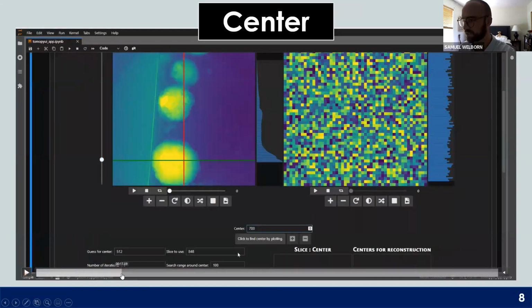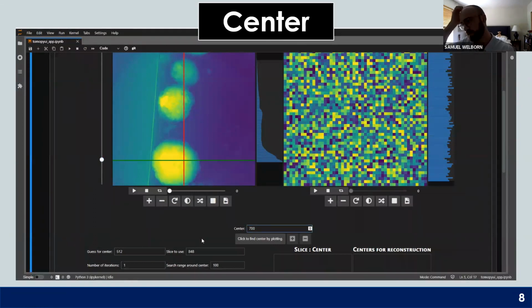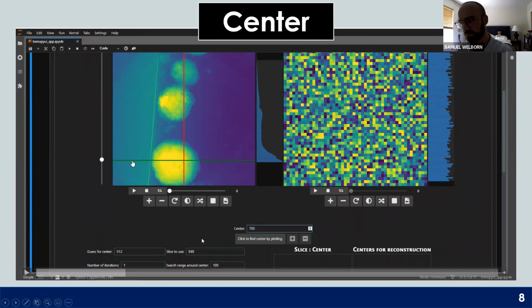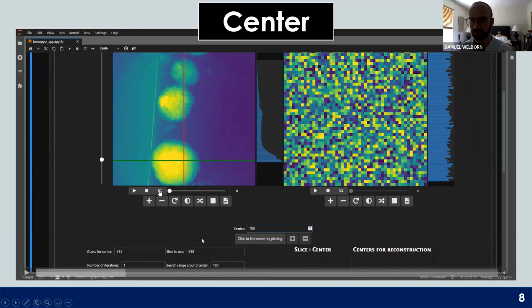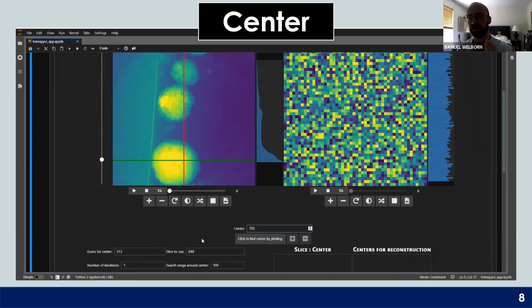Yes. For everyone who's maybe not familiar with it, reconstruction works by taking a slice through all of these projection images at a particular value of y, and using that sinogram for that slice to reconstruct one part of your reconstruction domain. For this you have to use a center of rotation. You can use just one center of rotation, or if your acquisition instrument has some physical tilt axis, then you would want to reconstruct along multiple centers of rotation throughout that y-axis.